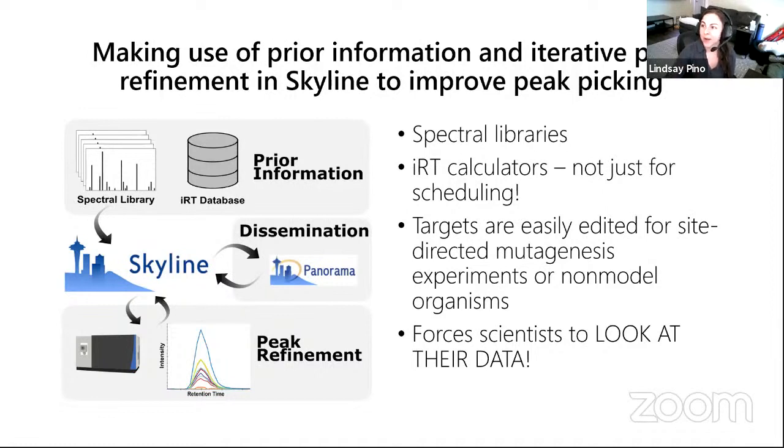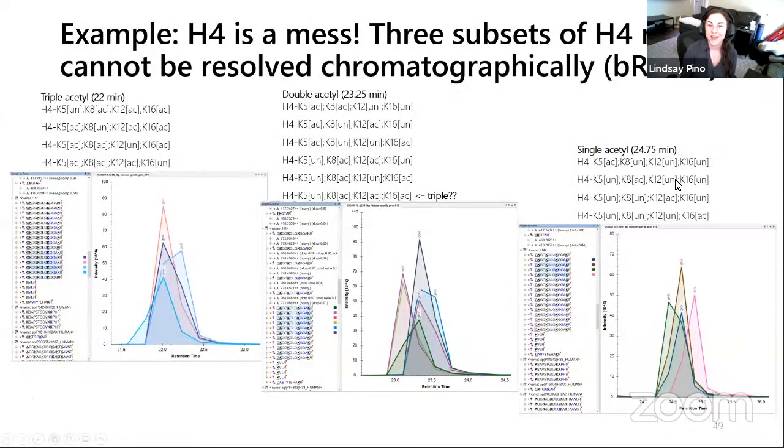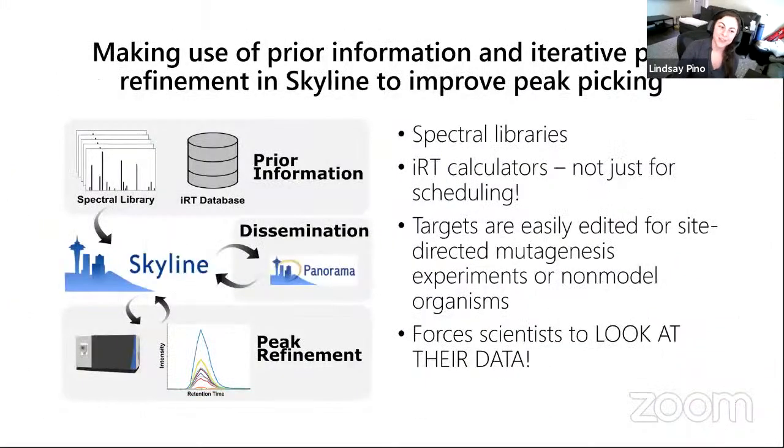Oh, there was a quick question in here about derivatizing the lysines. All of this that I showed you is with the lysines derivatized. I say it's unmodified, but it's actually propionylated. So these are all derivatized, and chromatographically that does not change their elution off of a C18 column at all, which is unfortunate. Okay. So we're going to use Skyline.